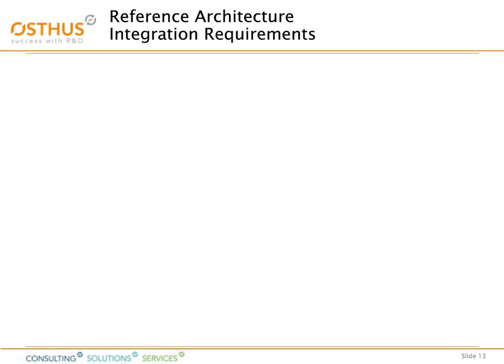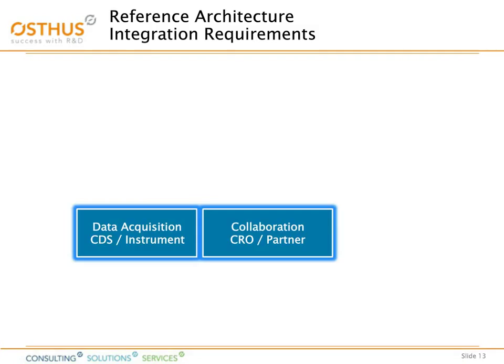So how can they look? I'm just going to present you with a very high-level, simple reflection of a reference architecture showing the combination of laboratory workflow and the data analytics. So first of all, as Friedrich already said in the introduction, most of the time the data is generated within labs, on instruments, or at partners and CROs.